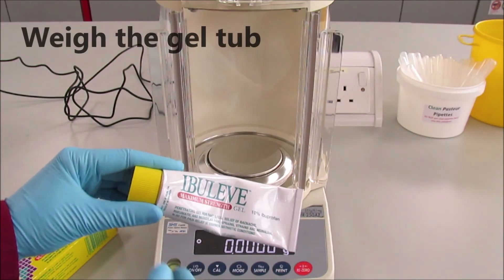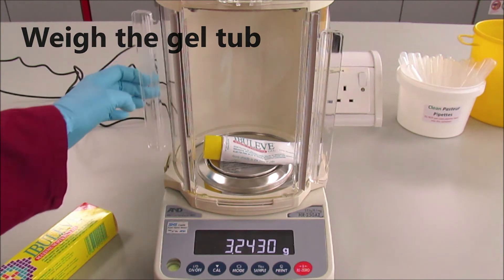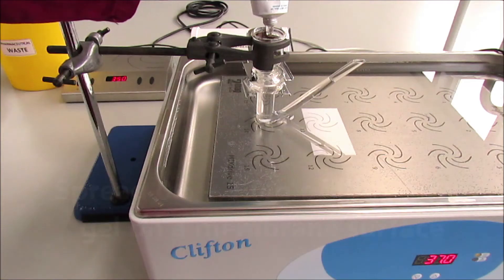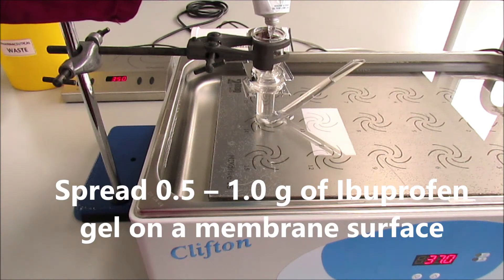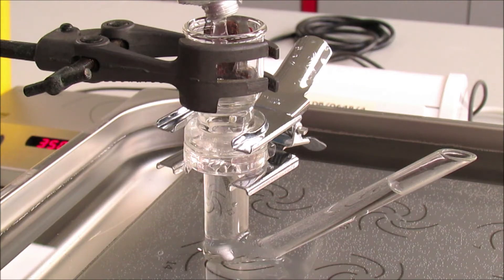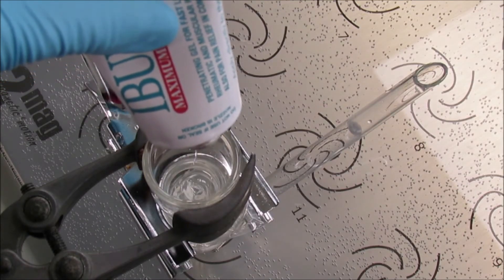We also need to check the weight of the gel tube before the experiment. Then once we charge the FRANS cell with the gel, we will weigh the gel tube again. By the difference we will work out how much gel we have placed on the membrane.